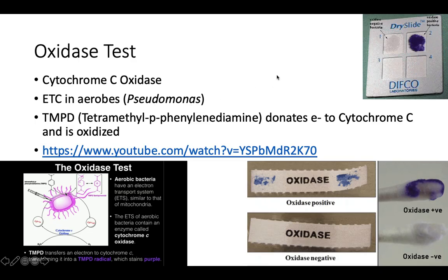So you get a patient that has a gram-negative infection. You see that underneath the microscope. You grow it on a petri dish, and this is the first test you're going to do, just like a catalase test, to tell apart your gram-negative rods. Is it an Enterobacteriaceae species or a pseudomonad species? If it's a pseudomonad species, you're done. You know what to do. You can treat that. If it's an Enterobacteriaceae species, you have to do some more tests to figure out which one it is. So this is how you tell apart the two different broad families of our gram-negatives.